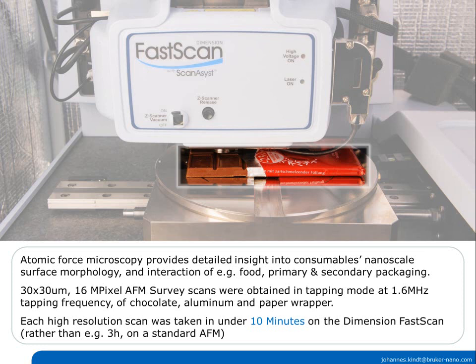Turn on the hot plate until hot to the touch. Put the piece of chocolate on a glass slide. Put on the hot plate for 5 seconds. Immediately put in the freezer for 30 seconds. Done. The chocolate top or molded surface was relatively smooth here, tens of nanometers locally, and less than 2 microns over the full scan size of 30 microns.